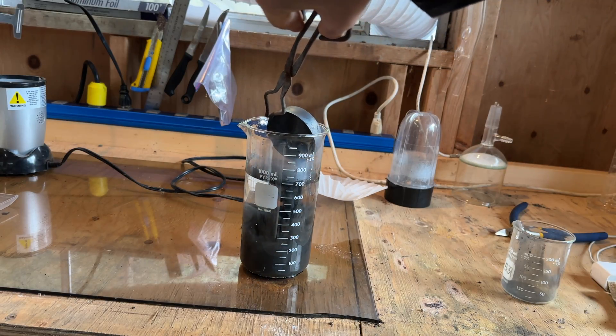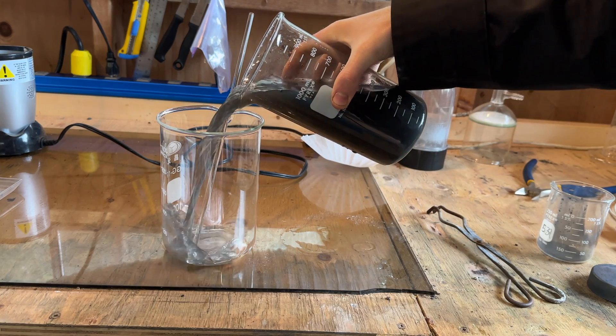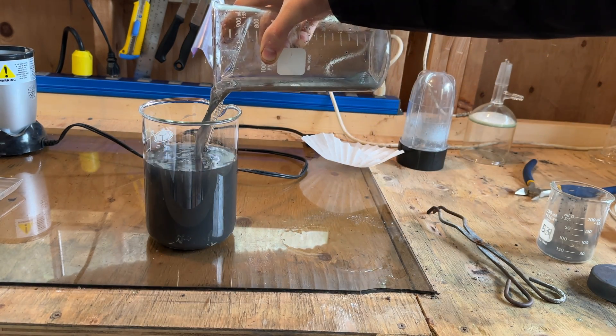The reaction mixture is added to a liter of water and stirred. The tin spheres settle out quickly, and the charcoal suspension can be decanted off. This is repeated several times to remove all of the excess charcoal.